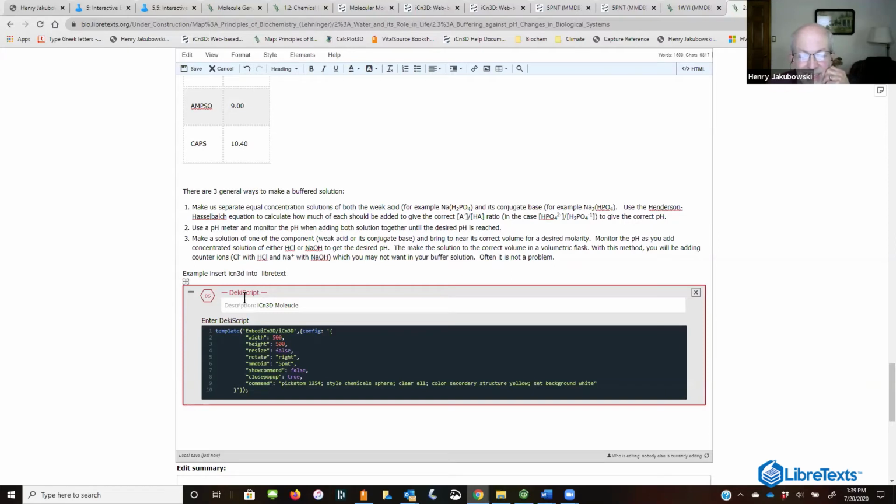So Henry, my script looks a little bit different than yours. In the very first line there, you've got config, and then that last curly brace has a single quote in front of it. I don't have that single quote. Let's just see if this works, okay? I'm just going to save this and hope it pops up.